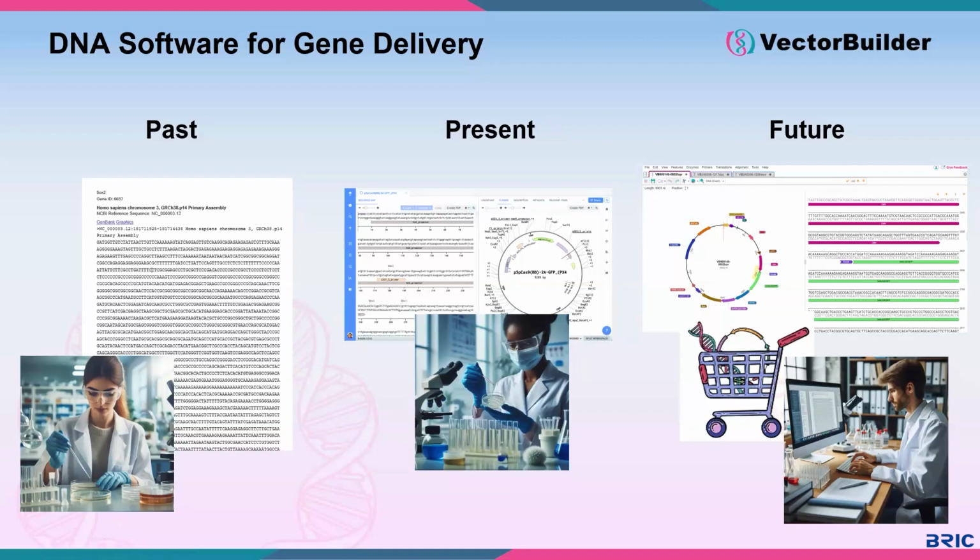Now, luckily, VectorBee not only allows for incredibly user-friendly and intuitive interaction with that sequence to make our perfect vector, but additionally, after making this beautiful vector, seamless integration with VectorBuilder allows for you to have this perfect vector in your hands in the form of a plasmid, a virus, mRNA, or an entire library with no bench work necessary, freeing you up to actually answer the questions for your research that only you can answer.